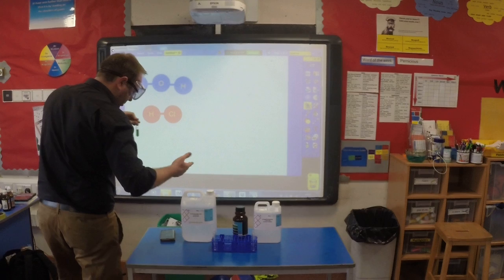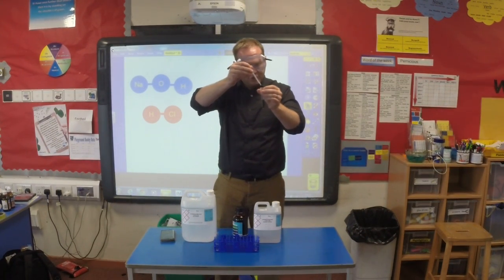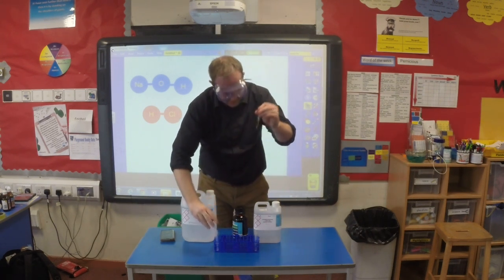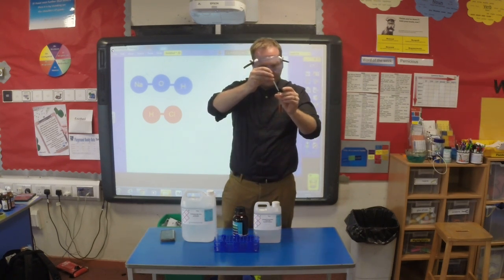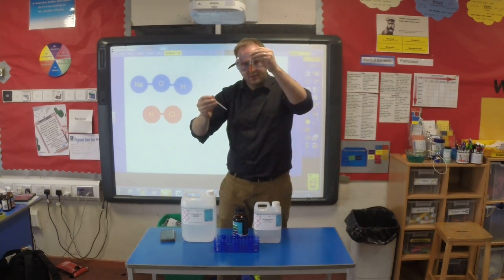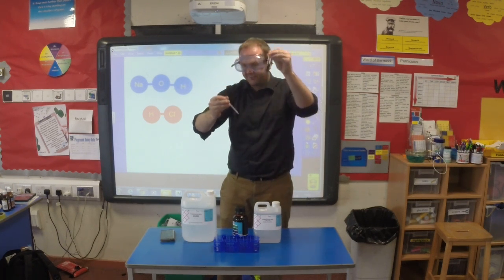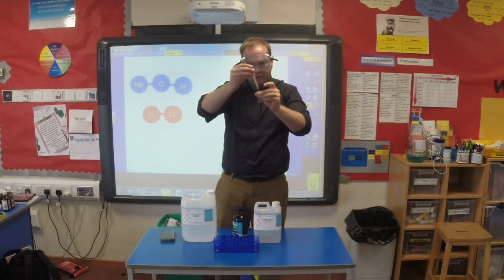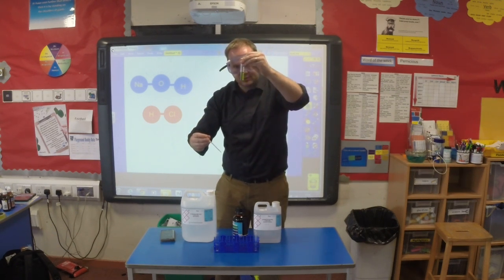But all we're looking for is the case to experiment with putting equal drops of acid and alkali in. So if I put 2 drops of the acid in, 1, 2, give it a shake, very definitely red again. And if I balance that with the alkali, 1, 2, no, that definitely wasn't enough. Too far the other way. Not quite getting it right, and I think the concentrations here might just be slightly off, to be honest. Or perhaps there was some residue in one of the test tubes already. There we go. Looking a bit better.